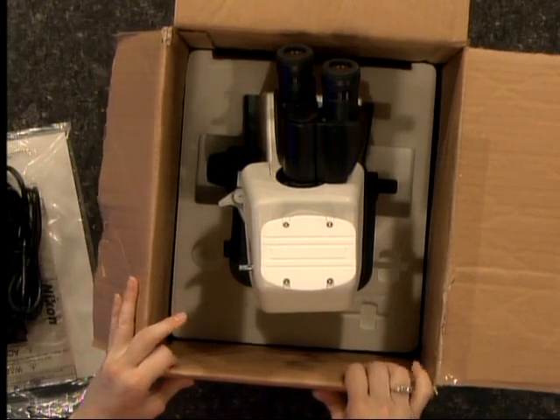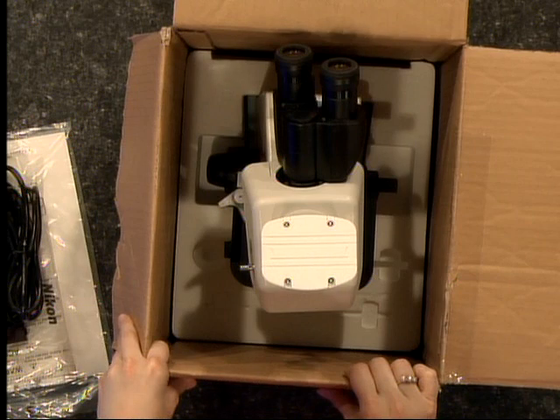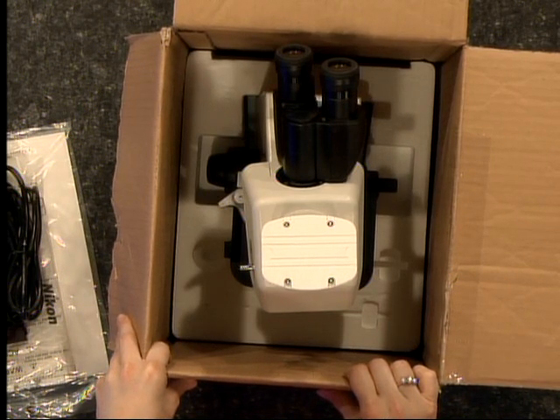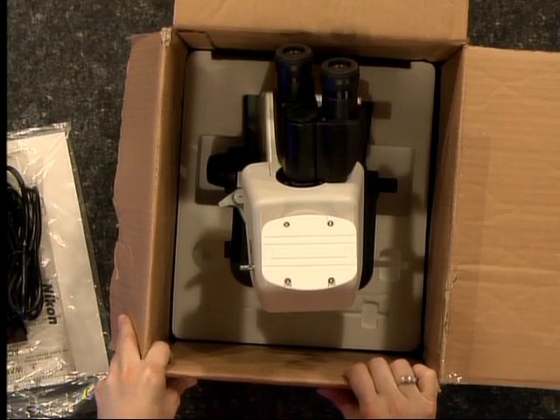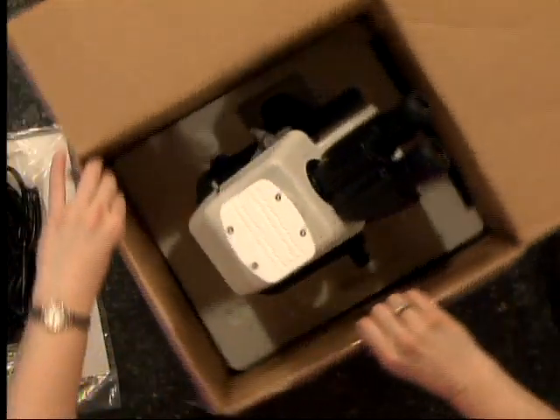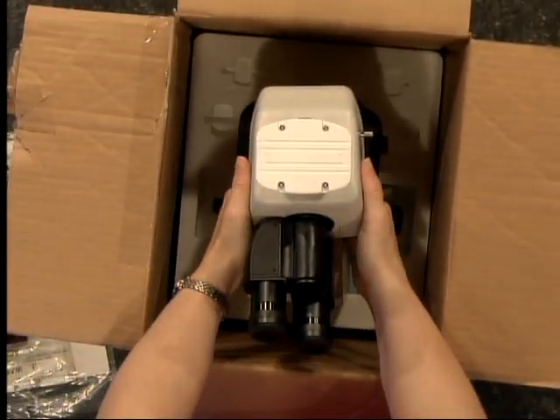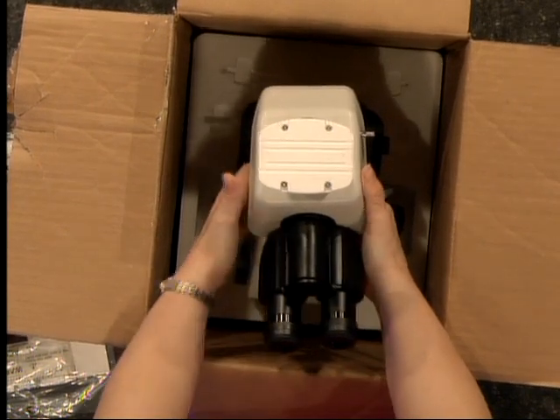The way that you should grab a microscope to transport it is to put one hand on the arm of the microscope and one hand under the base. Right now the microscope is buried in styrofoam, so I'm going to put two hands on the microscope arm and carefully lift it out of the box.